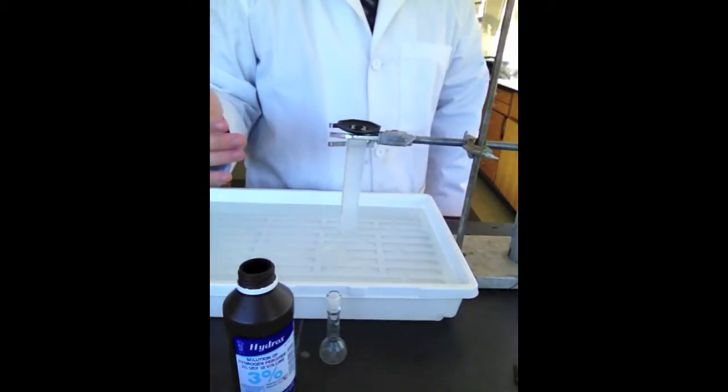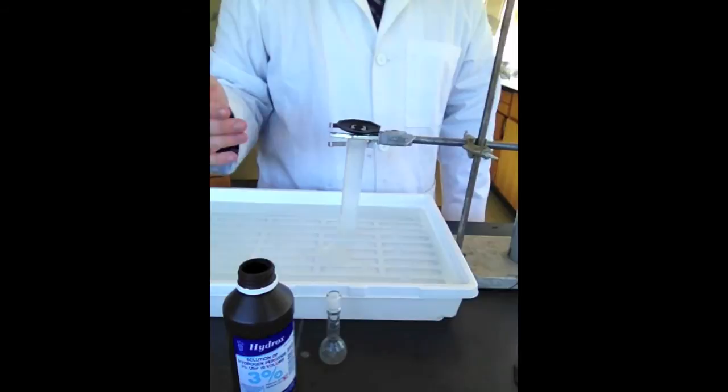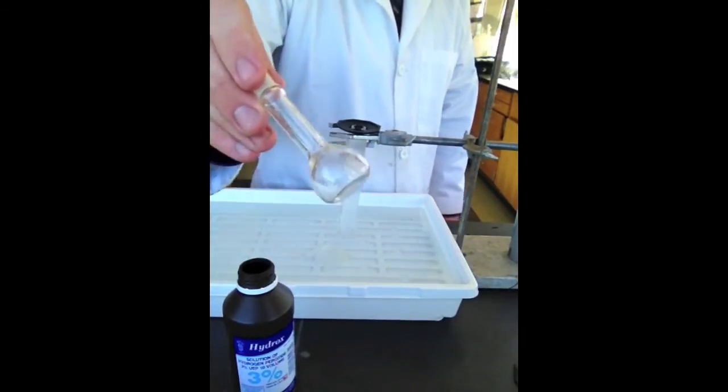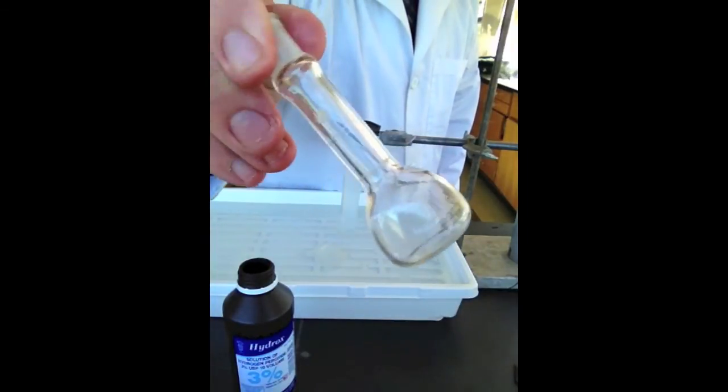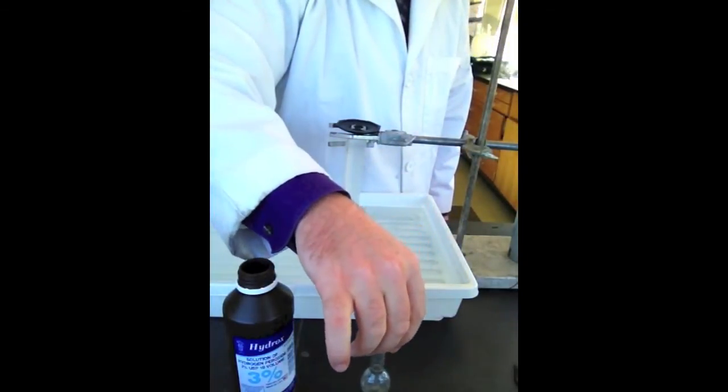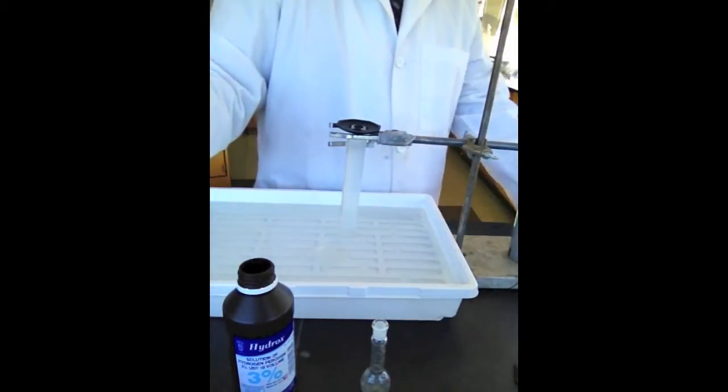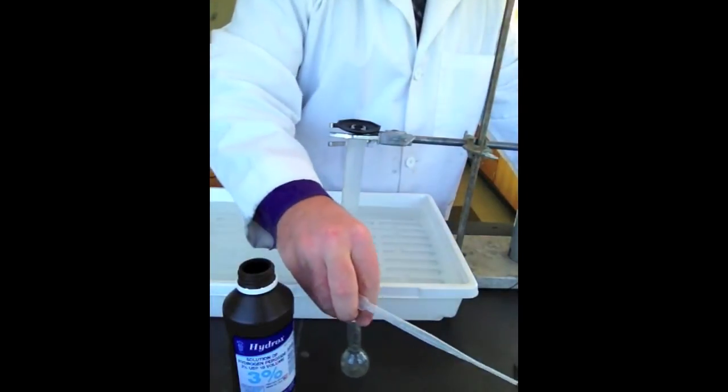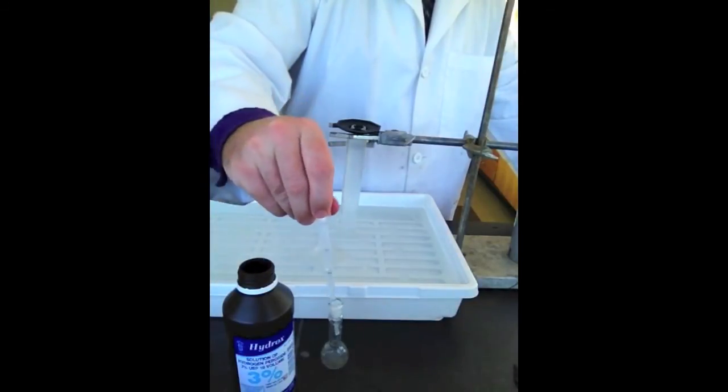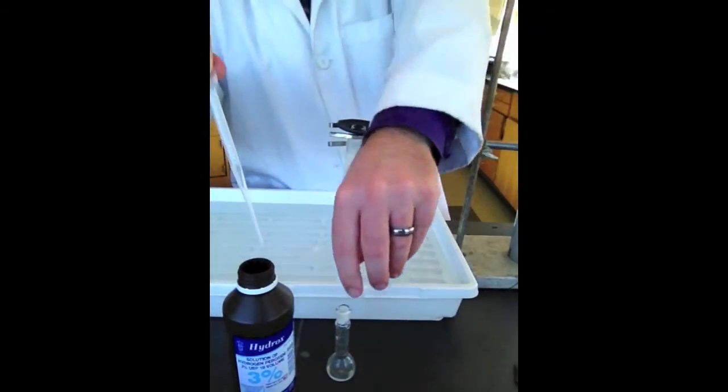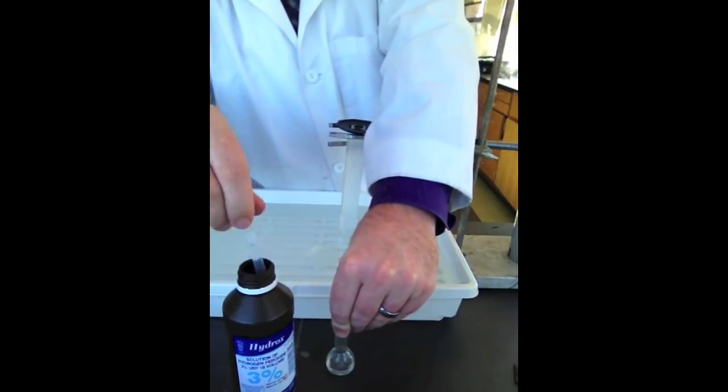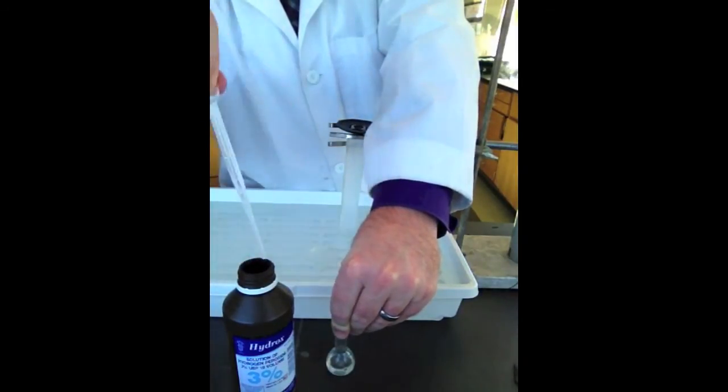All right, your lab manual says to get a 10 milliliter graduated cylinder. But instead of that, I have a 10 milliliter volumetric flask here. You can see it says 10 ml on there. And you can also see there's a white line on the neck of the cylinder. If you bring your level of liquid up to that level, that means that it's exactly 10 milliliter. So, it's a little easier than the graduated cylinder. So, each group is going to get one of those. So, we're just going to fill up one of those to that line. And that's going to give us our designated amount of hydrogen peroxide.